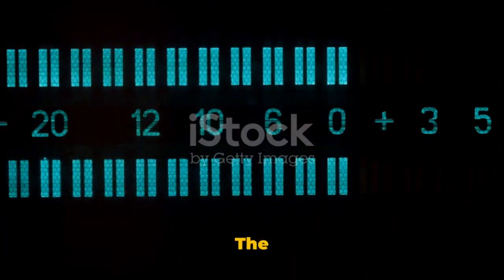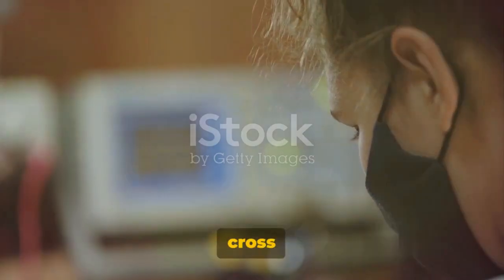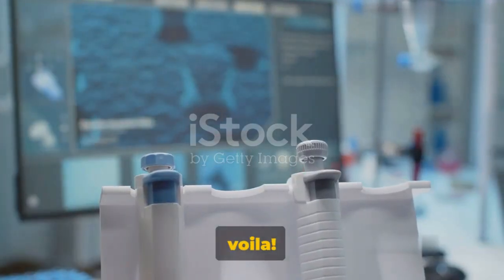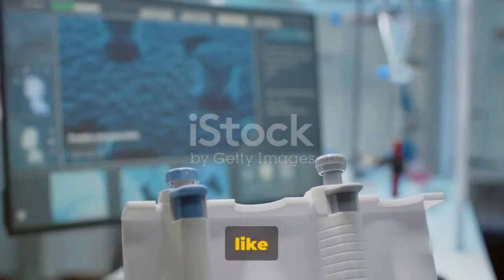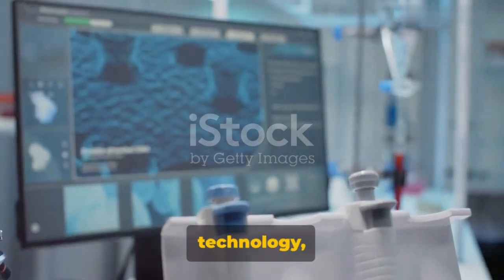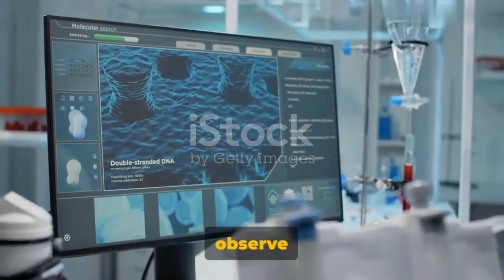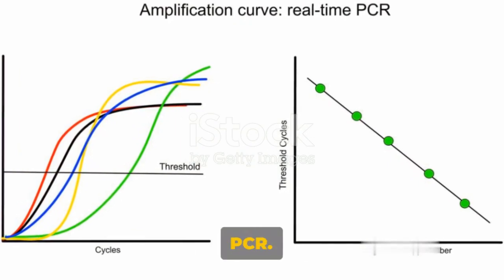But there's a catch. The signal can only be detected when it surpasses the threshold level. This is the lowest detection level of the detector. It's like a line in the sand that the signal must cross to be detected. This threshold level is crucial in ensuring the accuracy and reliability of our results. And voila! The amplified DNA is detected, and the results are ready for analysis. Just like that, with the help of fluorescence technology, tungsten or halogen light sources, and a detector, we can observe the amplification of DNA in real time. This is the beauty of real-time PCR.